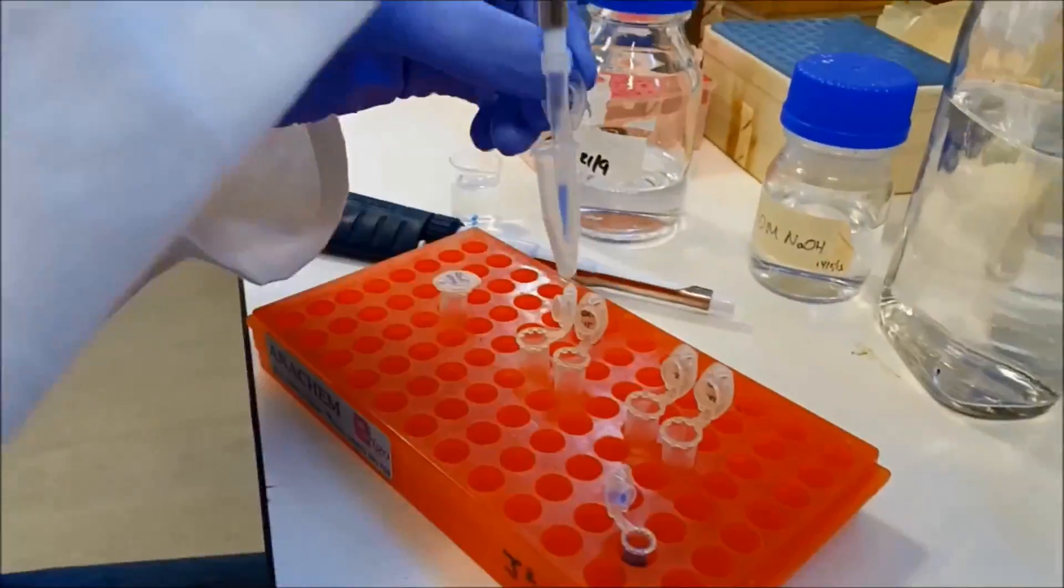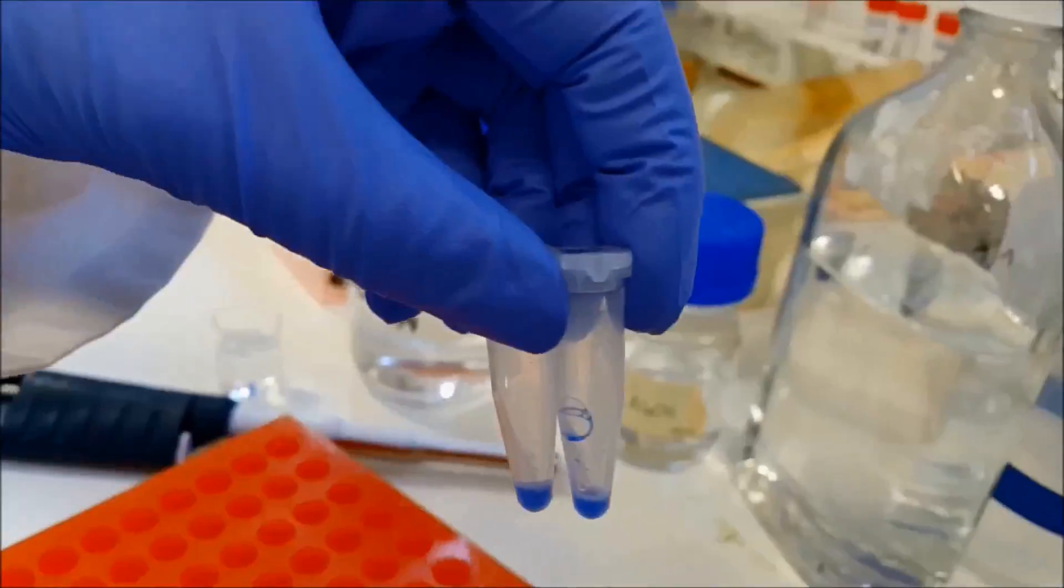We then add a loading buffer and heat the samples to remove the protein from the beads.